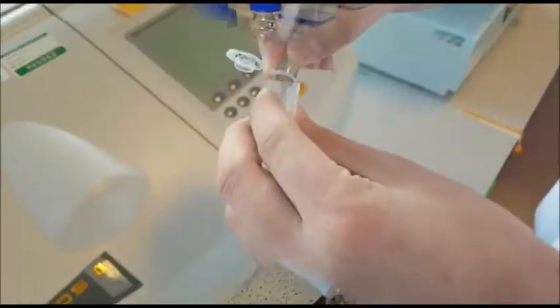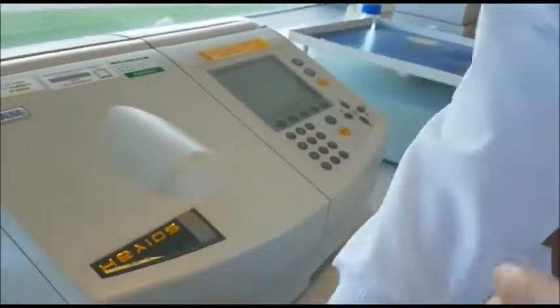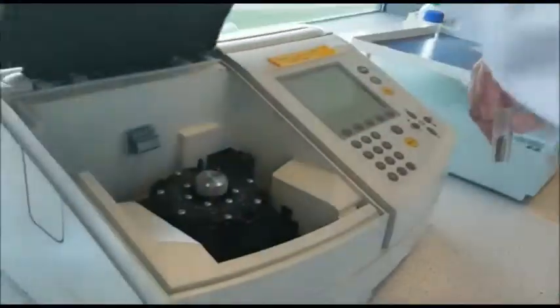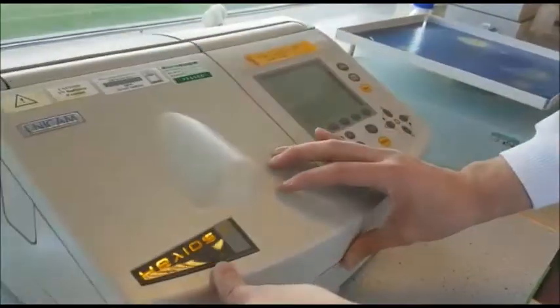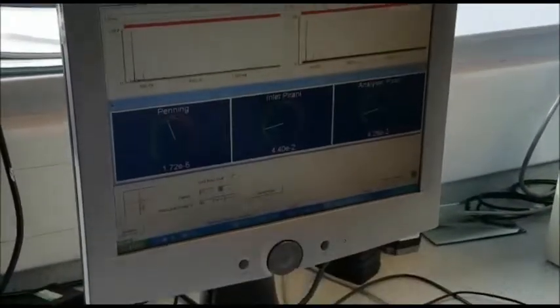A machine called a spectrophotometer was used to measure the absorbance of the solution. If the absorbance drops over time, then that means there is phospholipase activity present. As a final step to confirm that the purified proteins were snaclec and PLA2, they were analysed using mass spectrometry.